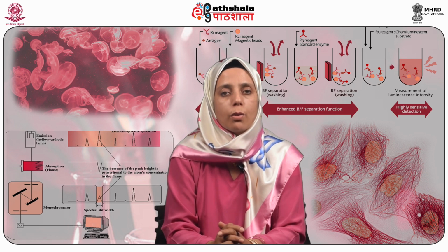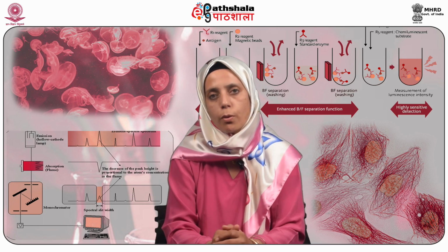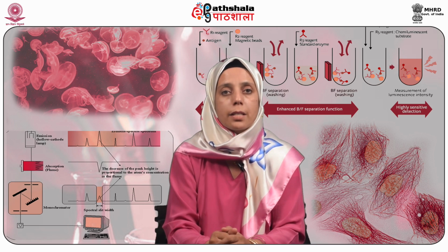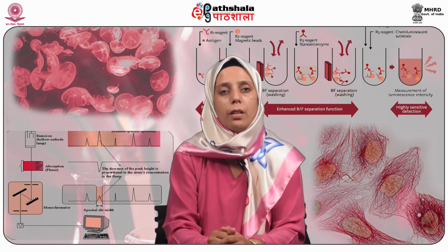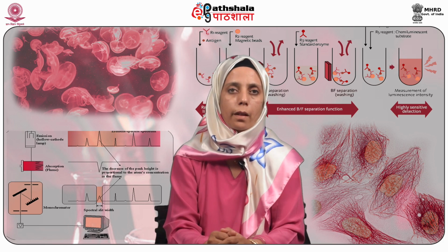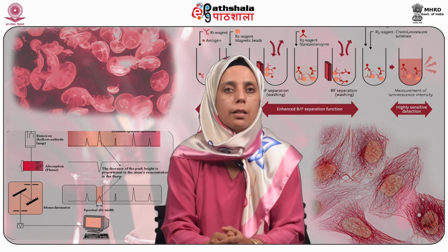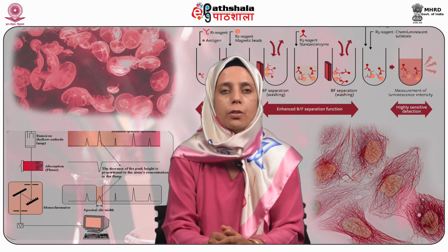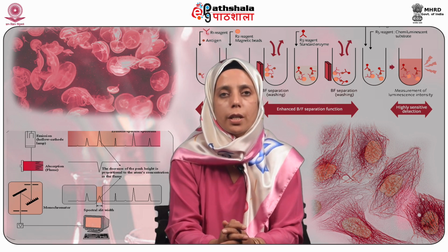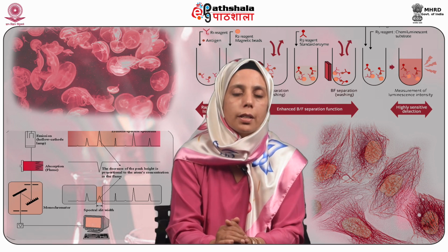A radiation of a narrow, limited, continuous group of wavelengths is very desirable for any spectroscopic analysis, because it enhances the sensitivity of the absorbance measured. It also helps in obtaining a linear relationship between the optical signal, that is absorption or emission, and the concentration of the analyte. Ideally, a wavelength selector should be able to produce radiation of a single wavelength or frequency. But that is not the reality.